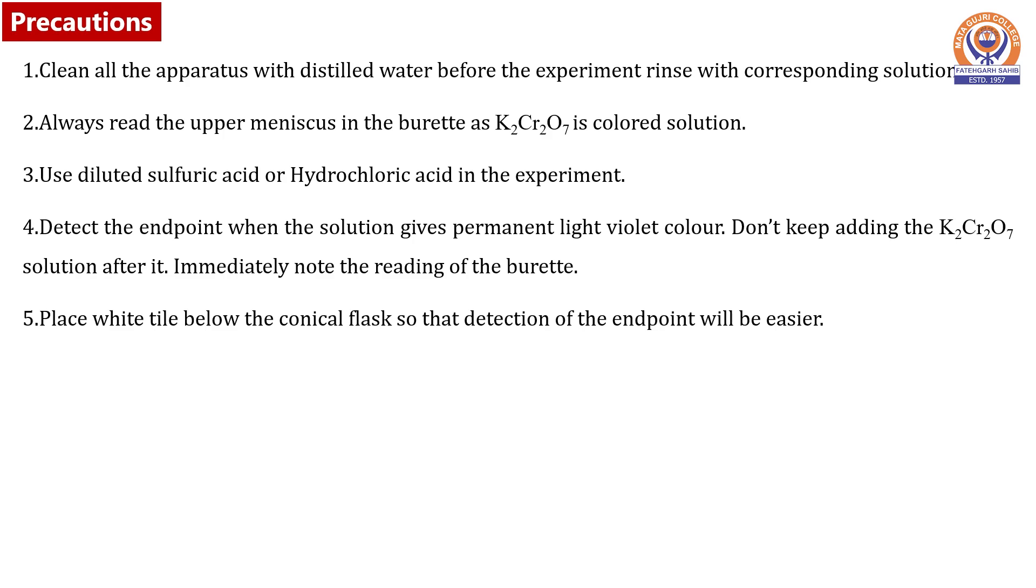Equal volumes of dilute sulfuric acid or hydrochloric acid is added to the titration flask. No heating is required during titration. Detect the endpoint when the solution gives permanent violet color. Don't keep adding the potassium dichromate solution after it.